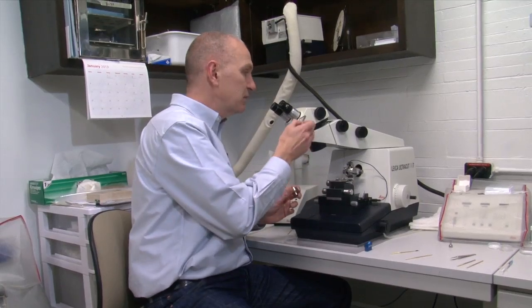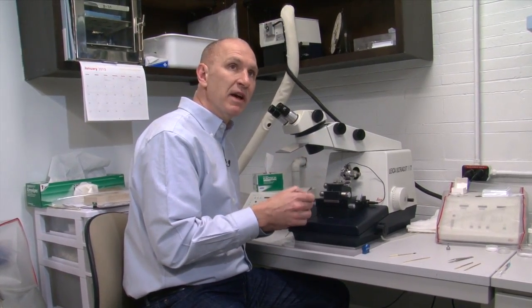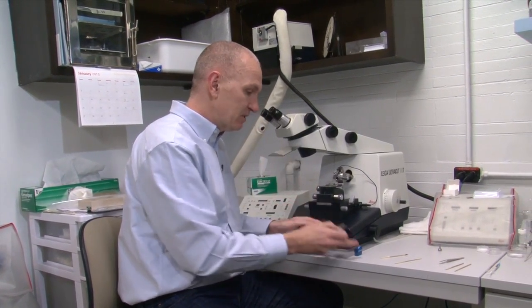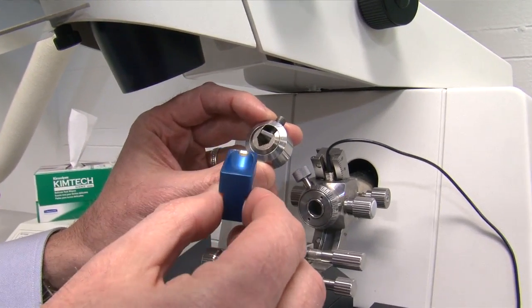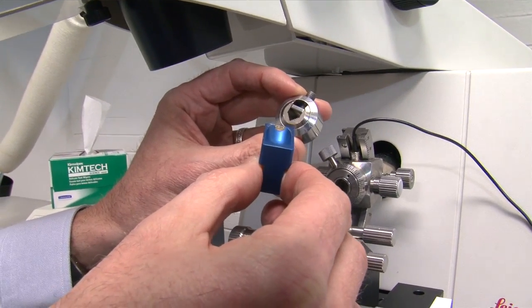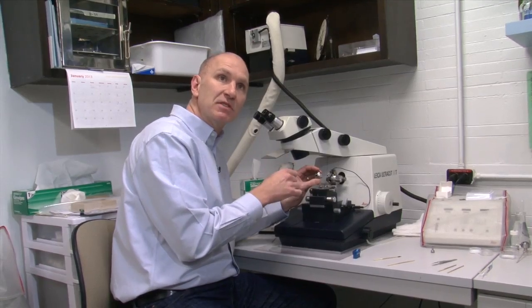For decades now, machines such as this — a microtome — have been used with glass knives and diamond knives to cut very thin sections of a sample, which are then brought to the microscopes. But this cutting process damages the samples.